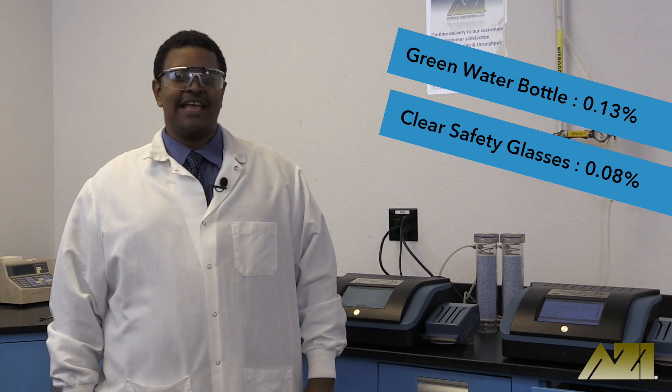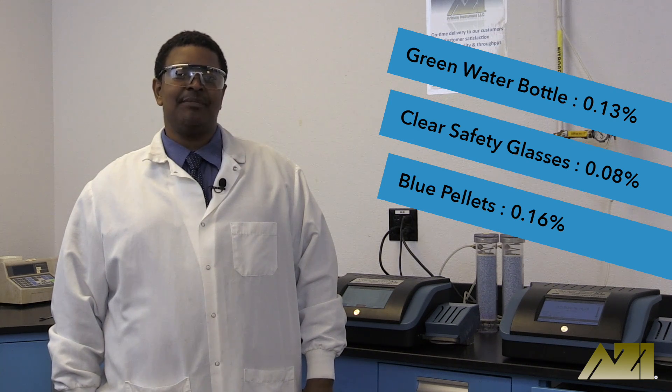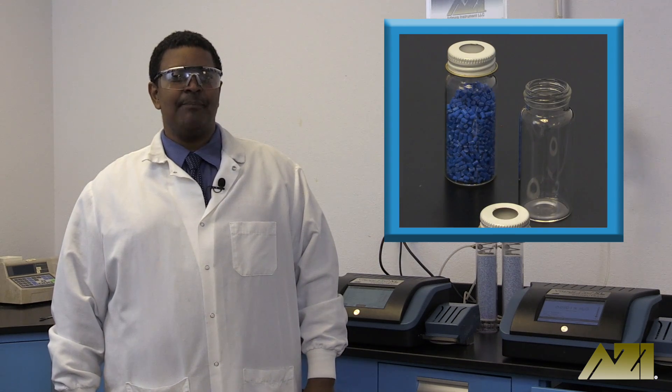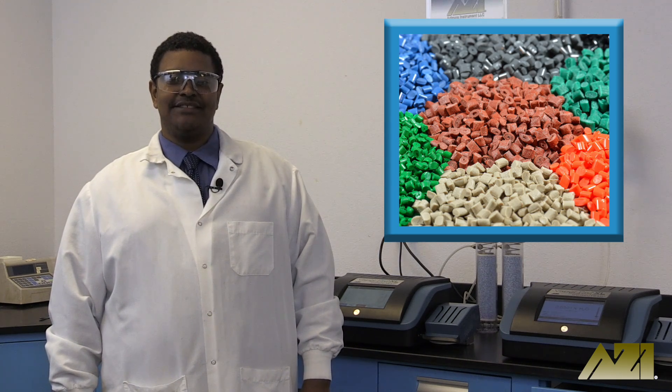The blue pellets came in at 0.16% moisture, making it the wettest of any of the polycarbonate samples tested today. The higher moisture content can be explained by the fact that it's not really 100% polycarbonate, and it has a colorant added, and it wasn't dried before testing.